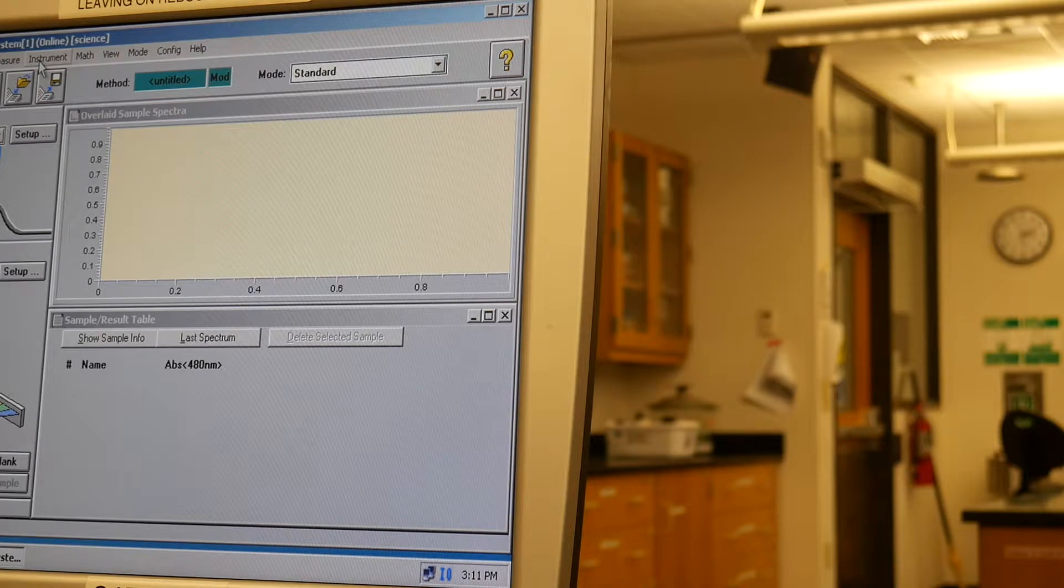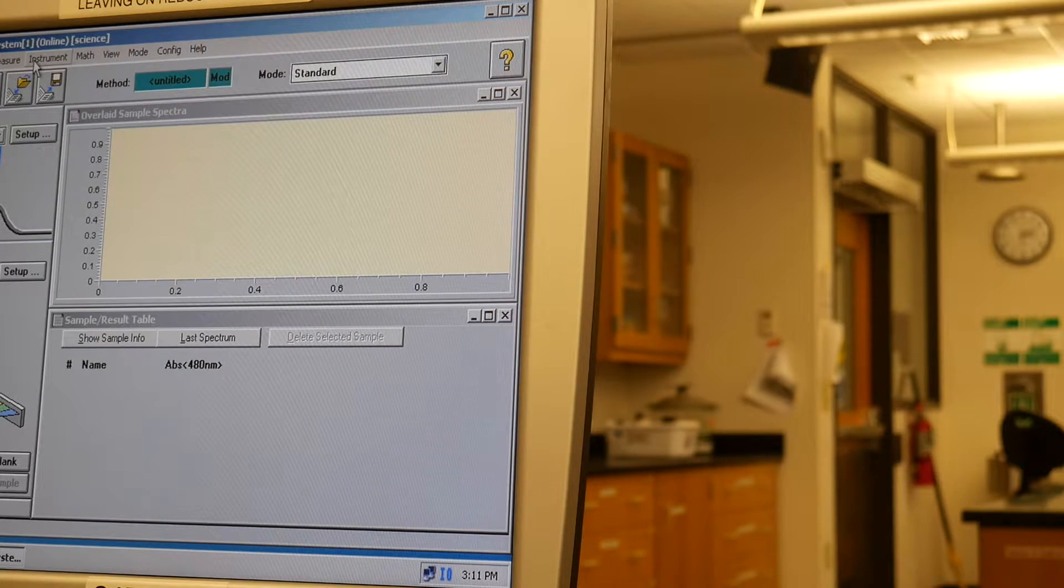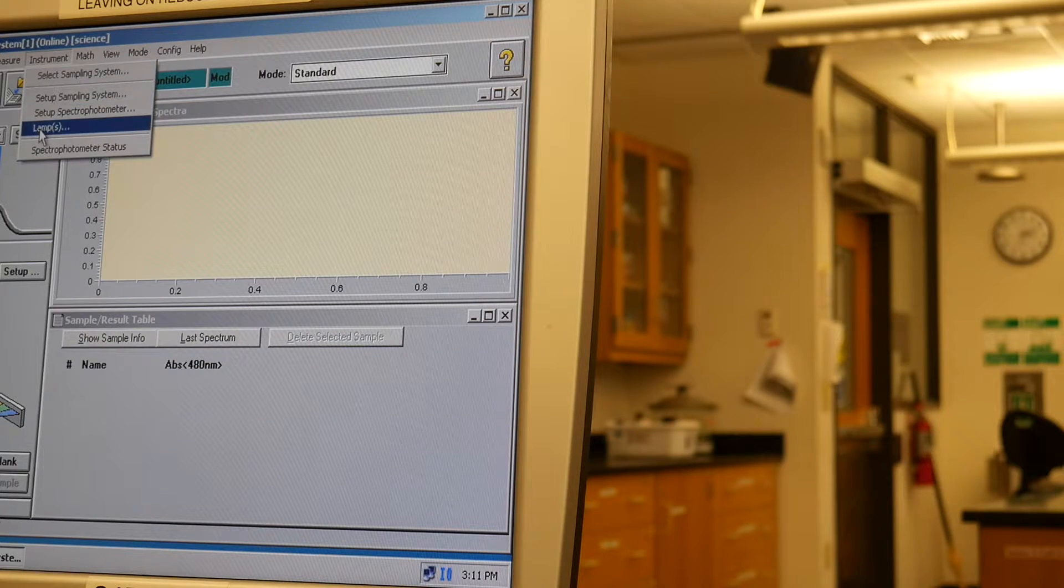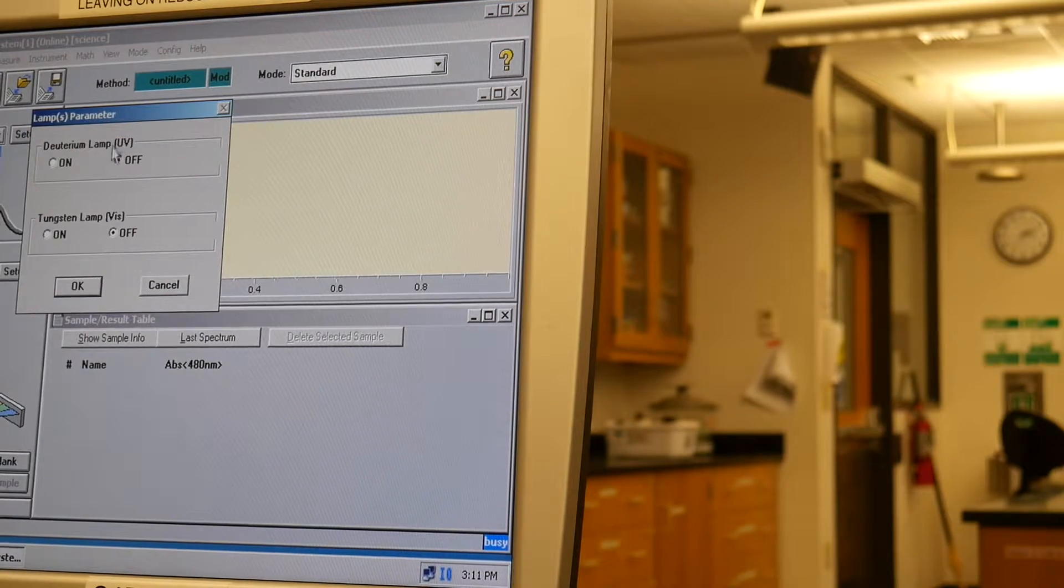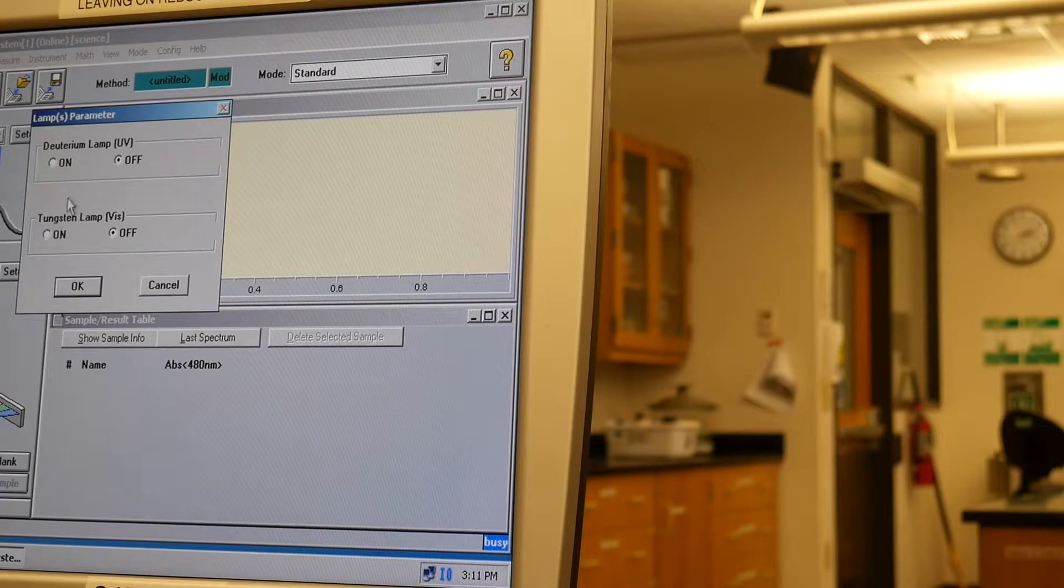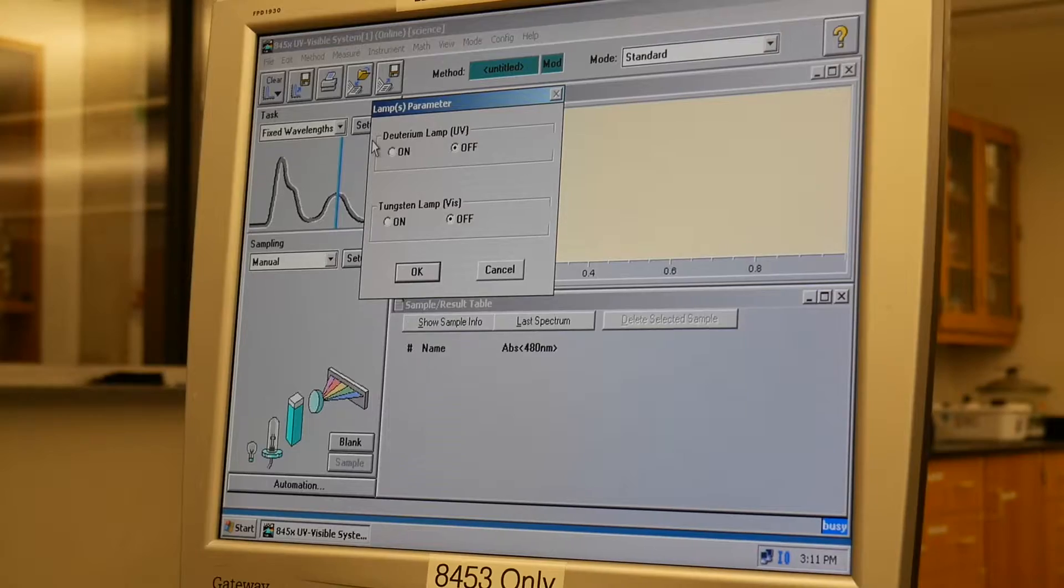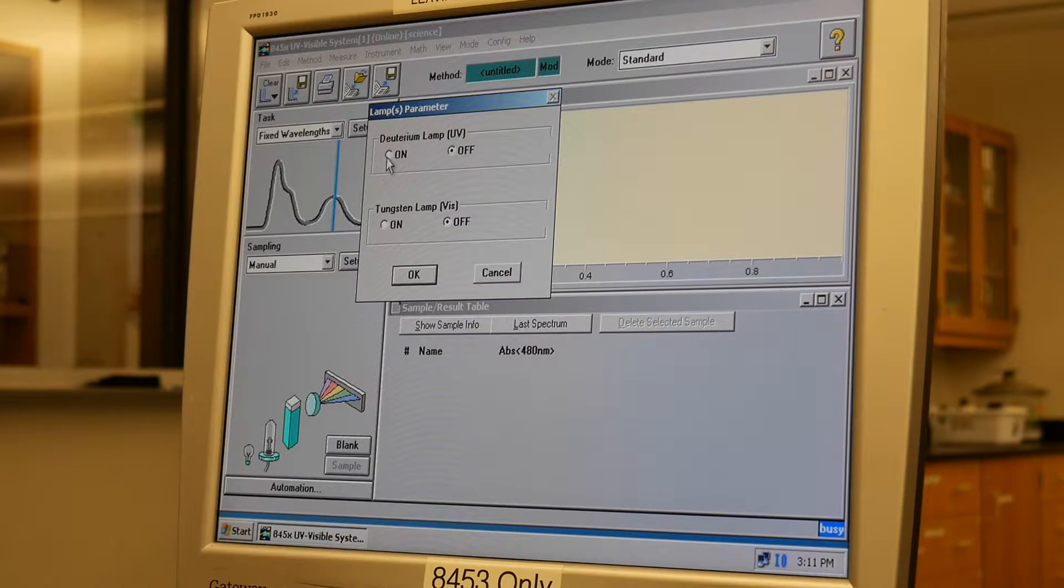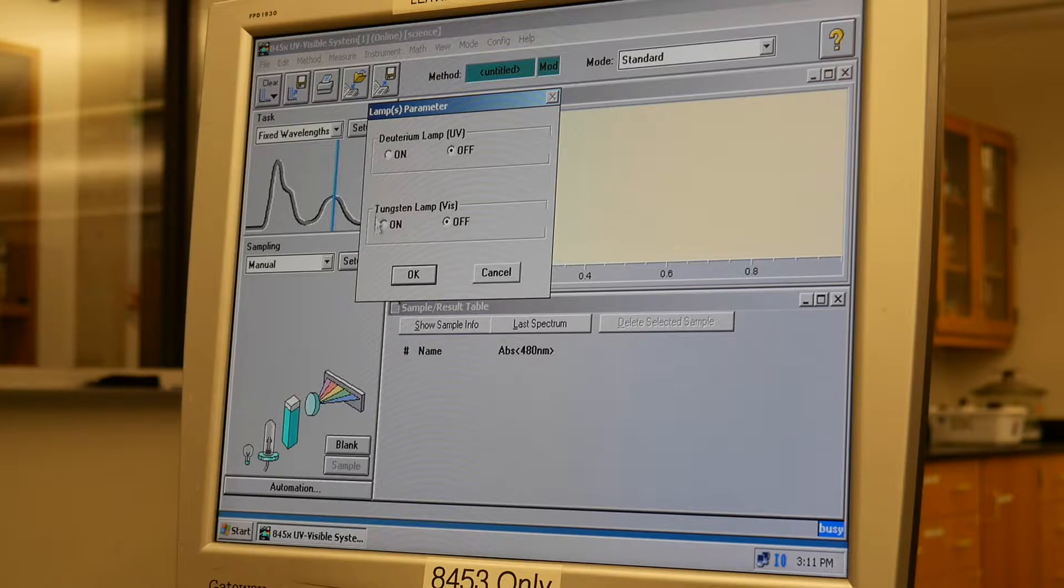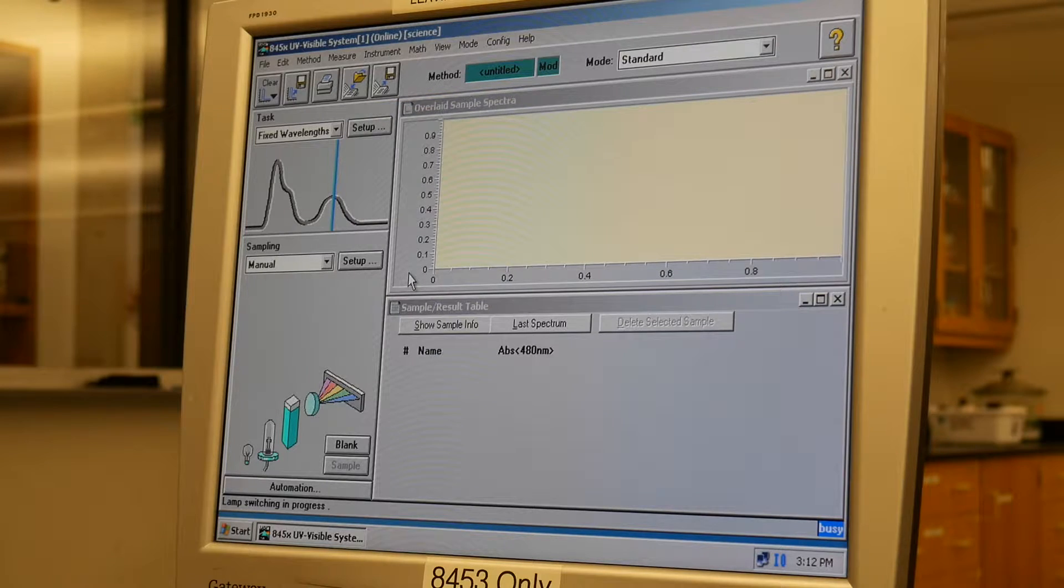Once you've done that, you're going to go to the instrument tab, and you're going to click on the lamp option, and you're given two options, the deuterium lamp and the tungsten lamp. We only actually use the deuterium lamp when we're actually working in the UV spectrum, and we're not. So we're just going to turn on the tungsten lamp and click OK.